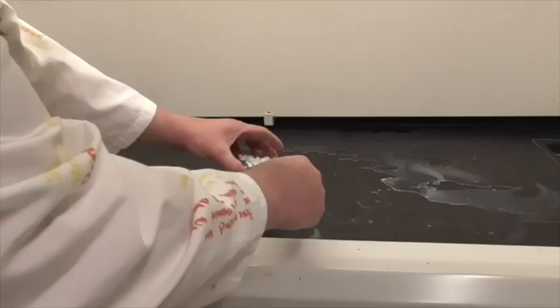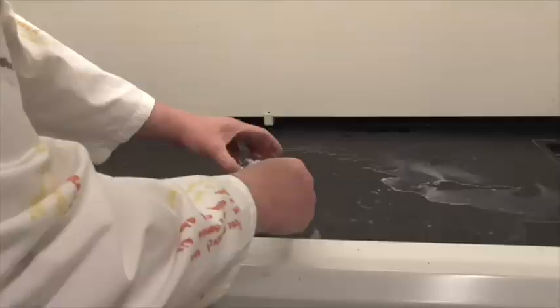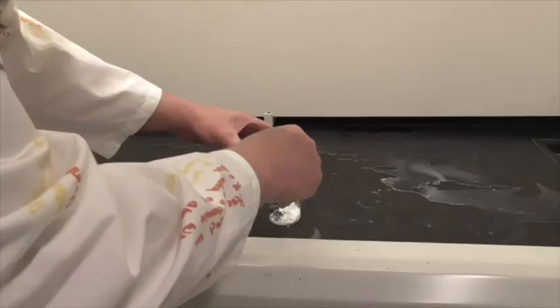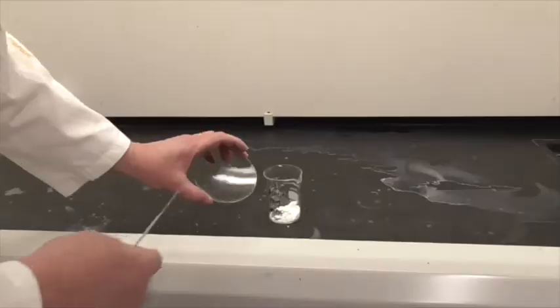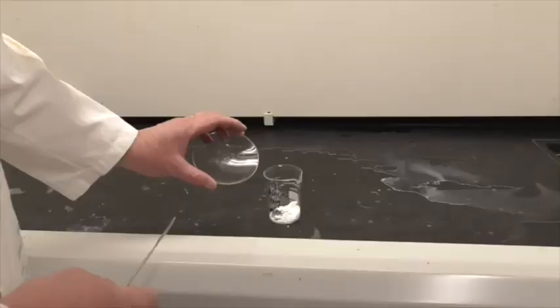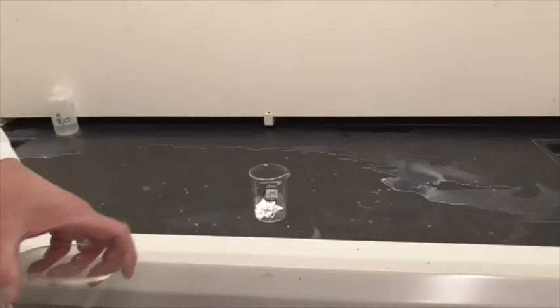We'll use it again for another experiment in a different class. Right, there we go. Just need to rinse off the watch glass and we're all done. All right, so: aspirin from CHEM111 lab, labeled beaker. And now we're all set.